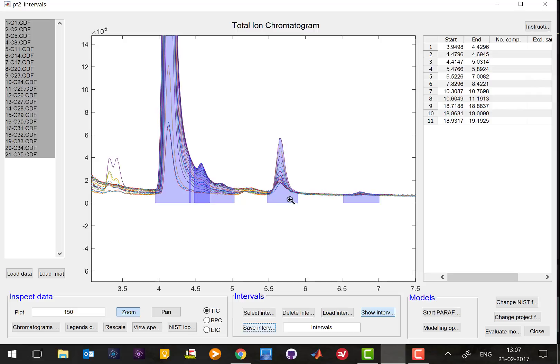So what we need to do is for each and every interval that we have selected we need to establish how many things are going on, and what that will provide us with is once we're done with that we will have the chemical spectra of all the species in the peak and we will have the relative concentrations.